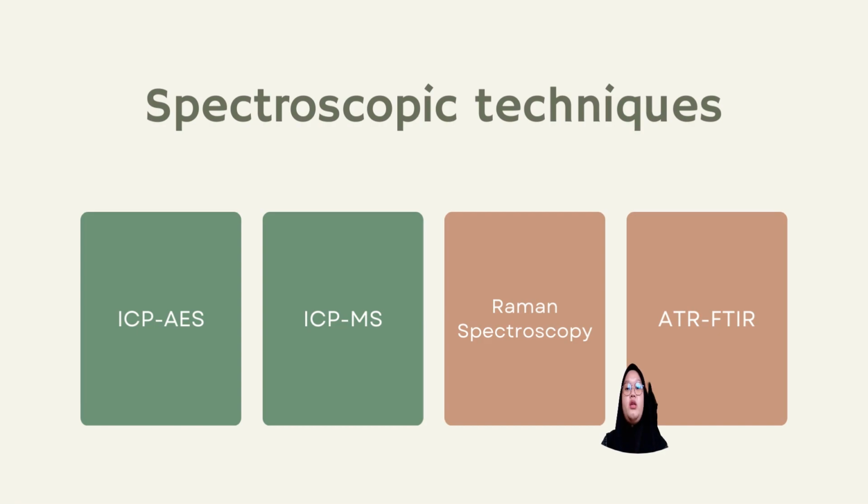Vibrational spectroscopies, which are Raman and IR techniques, are non-destructive and have imaging capability, and they are based on instruments that are simple to use with no sample preparation required. Vibrational spectroscopy combined with chemometric data processing is commonly used in forensic examination.